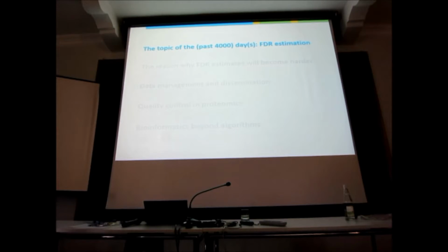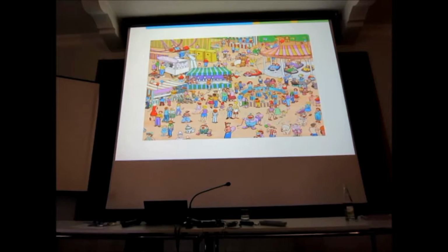So, FDR estimation. I usually use this amusing little picture that some of you may find familiar to explain what the problem is with identifying peptides. It's not a perfect analogy, but it works reasonably well. You have to find Waldo, or Wally, depending on where you are in the world. And you know Wally has this white t-shirt with red stripes, and you know, he's a funny character. And so what you do when you go through this is you check everyone and you see whether they match the mental image of Waldo.